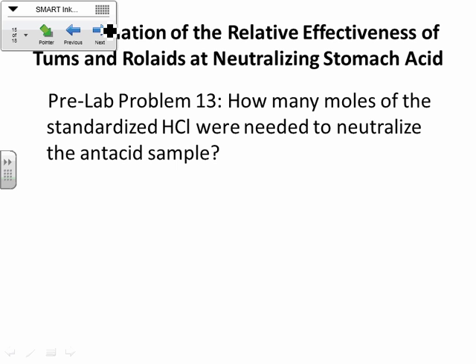So if we know that we started with 0.00253 moles of the HCl, that's how much we initially added into the antacid sample, okay?